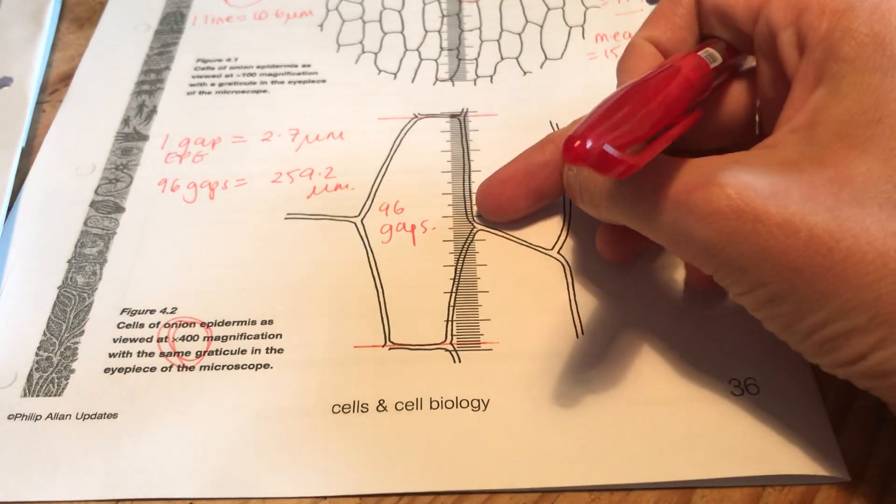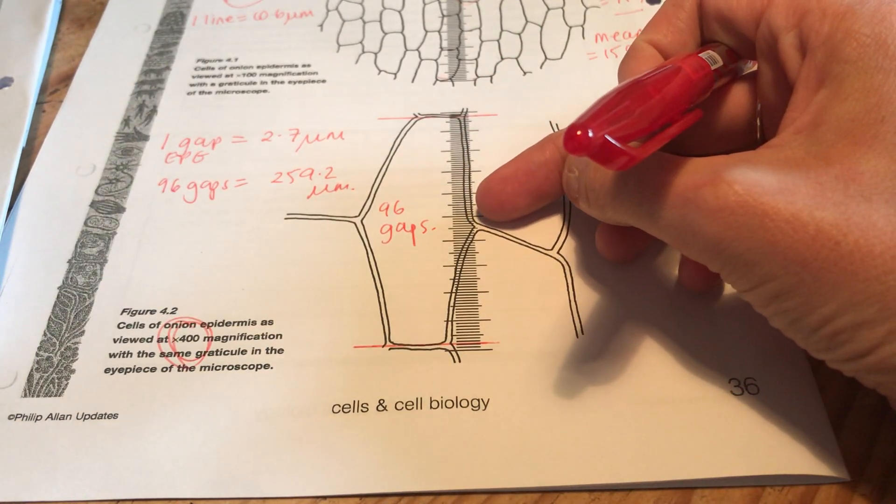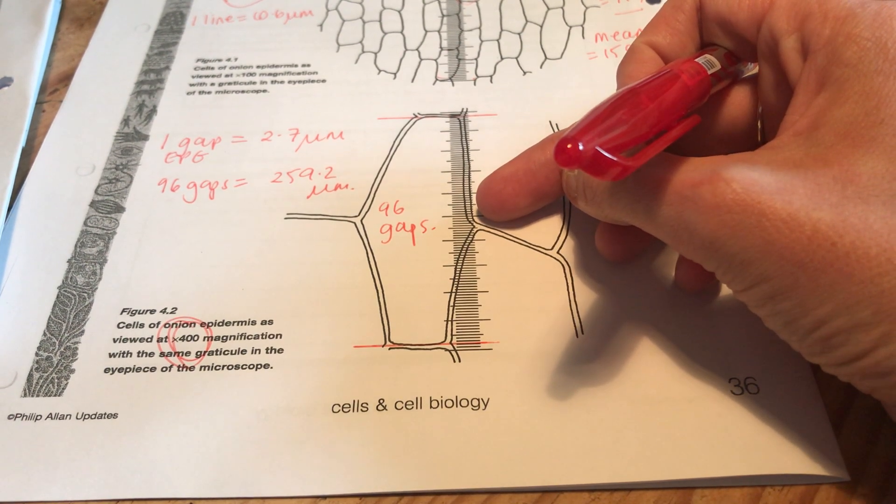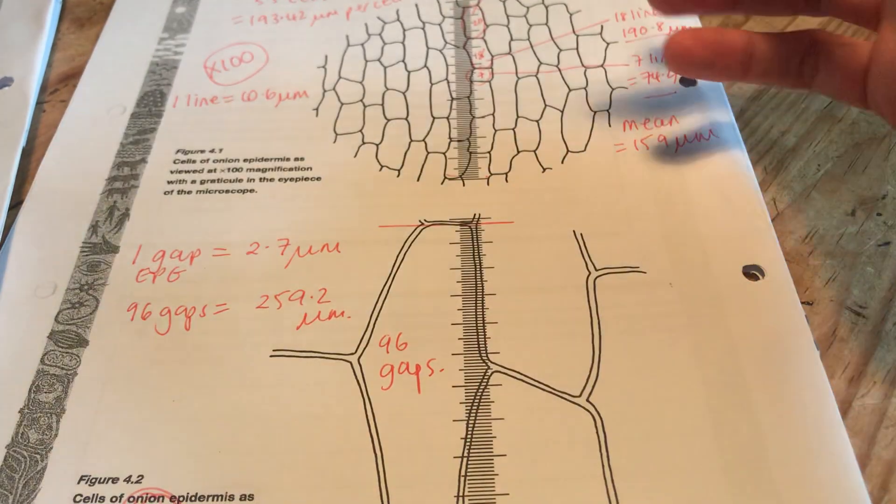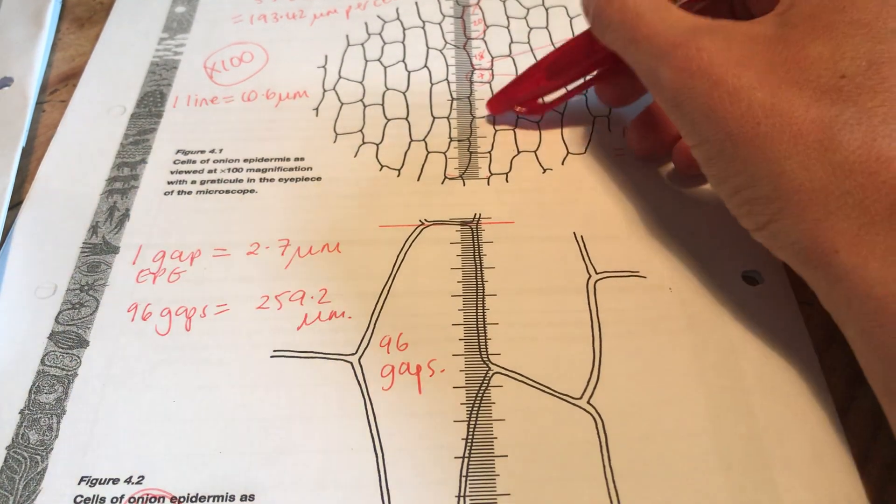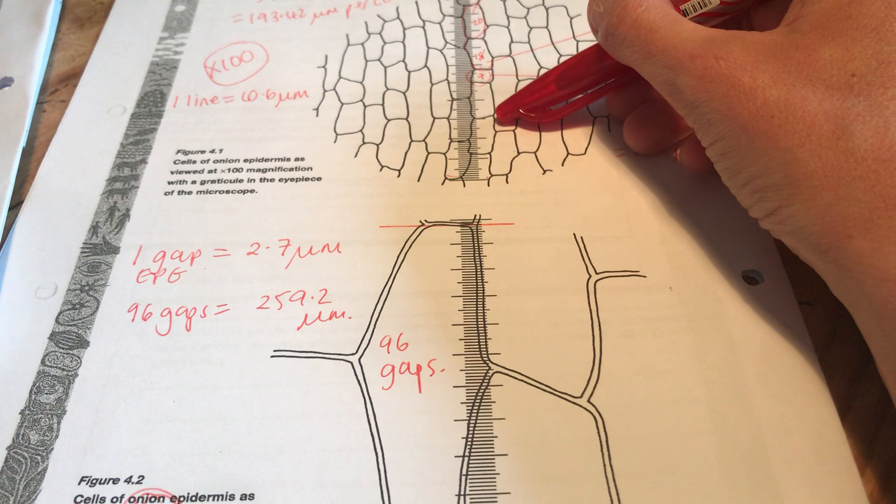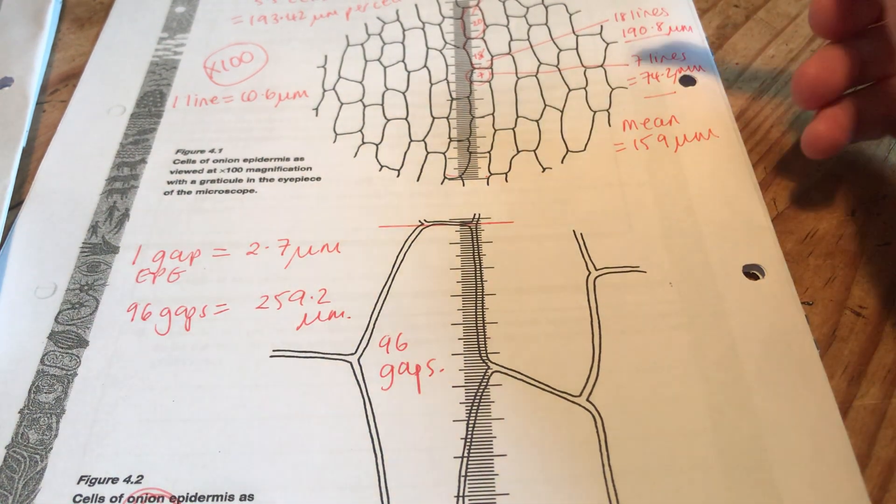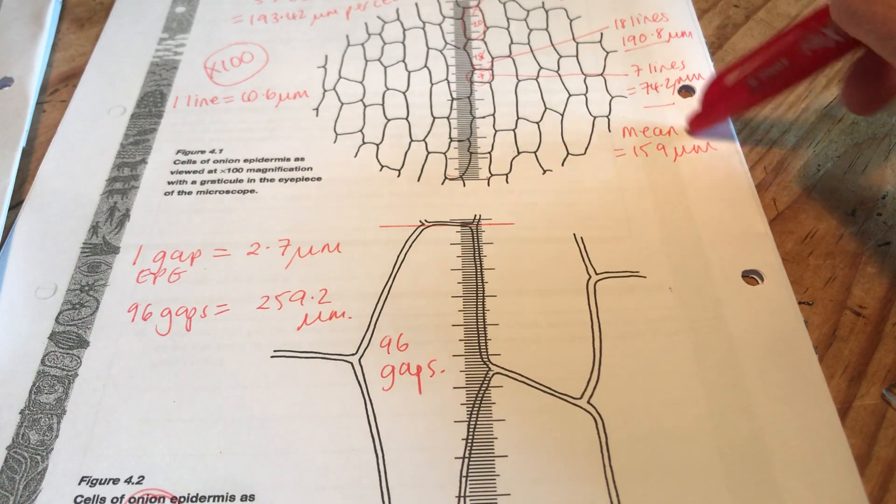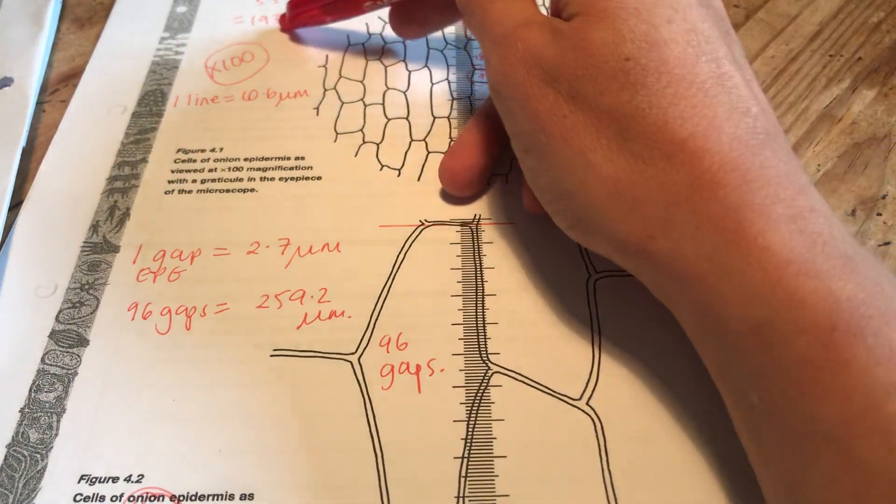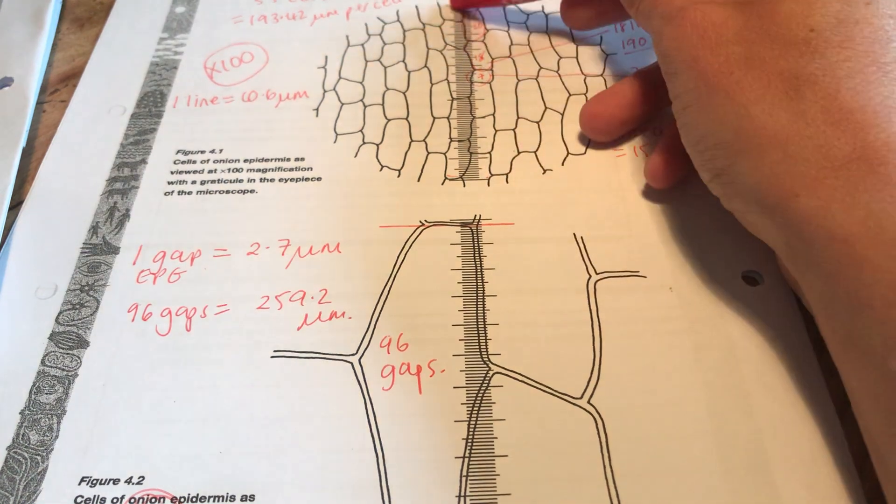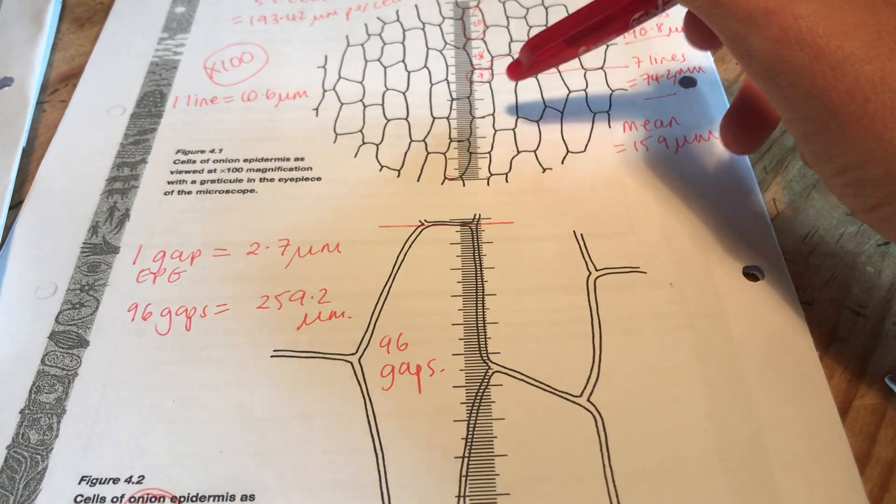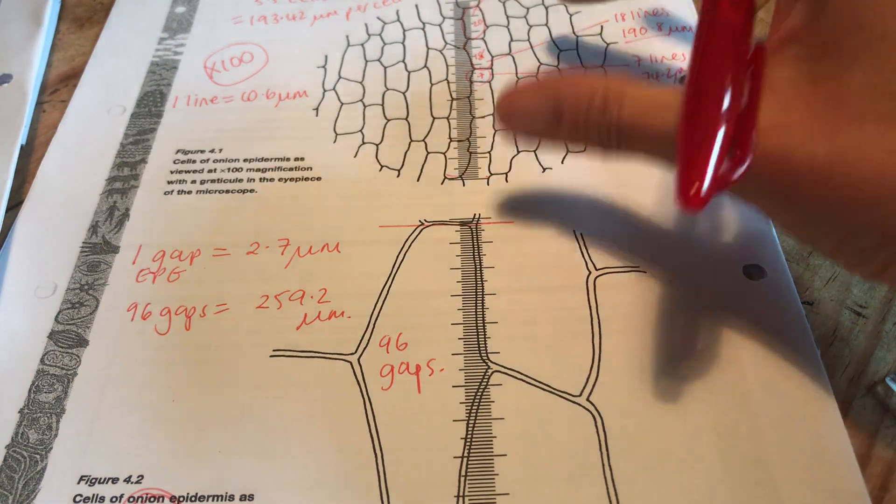This one, you haven't actually done a mean at all, have you? You've just chosen one cell. And that cell could be freakishly, anomalously large. We don't know. So actually, I would say that this answer to question two is a more accurate estimate of a mean, because we've actually had, we've not had a large sample size in the slightest. For this one, I did a mean of three cells. This one, I did a mean of five or six cells. So ideally, I'd want to do maybe 10 or 20 different cells and take a mean. And I try and sample randomly as well.